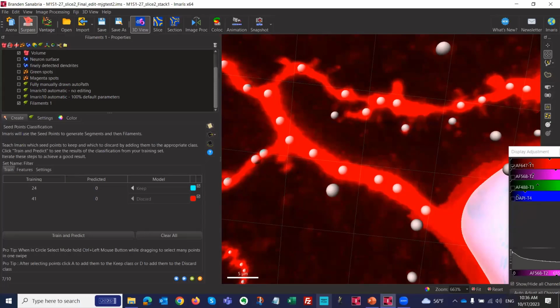Can you train this on 2 different images of the same type? Like with an image 1 of whatever experiment you want, and you have an image 2 for the experiment. I mean, not at the same time. So you do it once, you finish it up, you save it as a batch process, you apply the same one to the second one, and then do retweaking, and then you save the new one, and then you can apply this new one that's a combination of the first 2 on a third one, and so on and so forth.